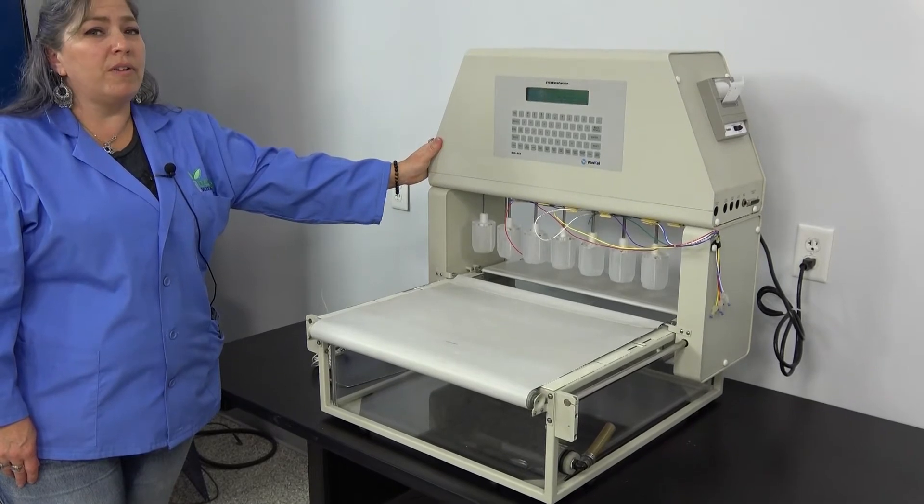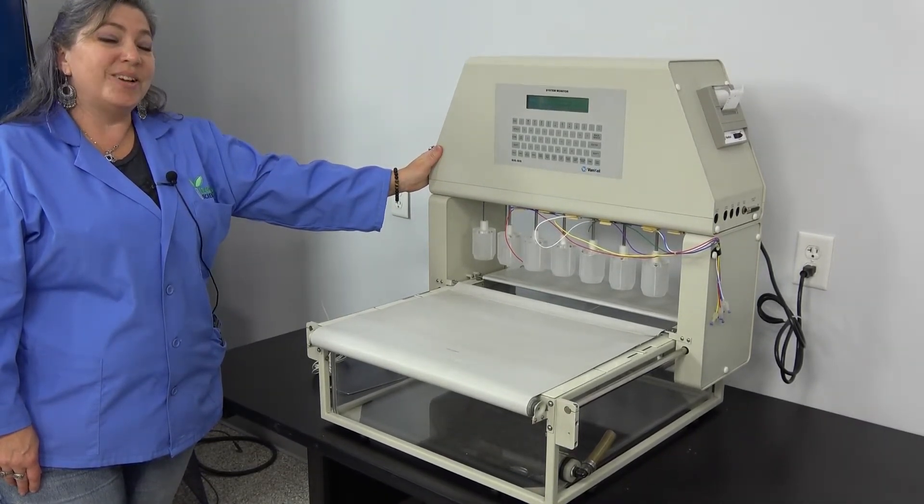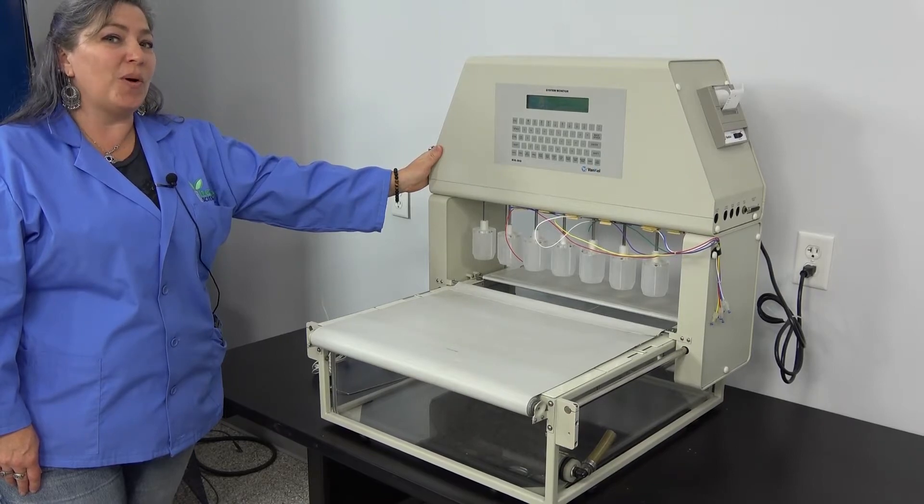This, as well as all of our working units, are sold with our 90-day warranty. We have it on hand in our Cridersville, Ohio warehouse.